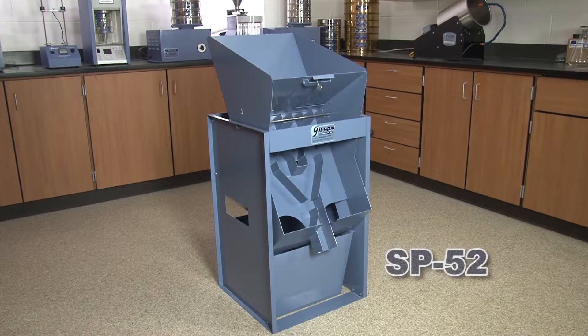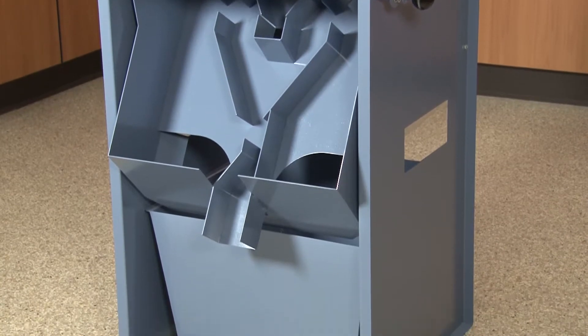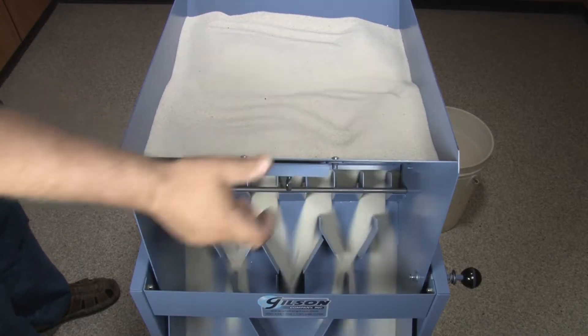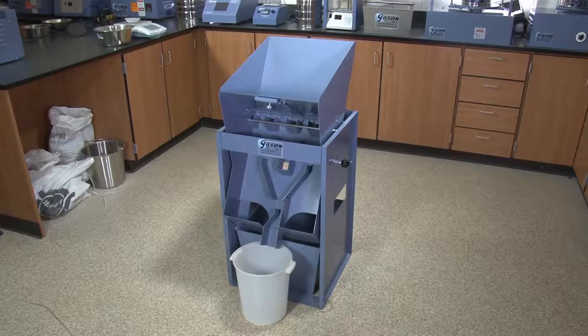Gilson's 1/16th sample reducer offers fast reduction of materials to 1/16th fraction testing size. This rugged unit has four times more sample capacity than other traditional 1/16th reducer models.